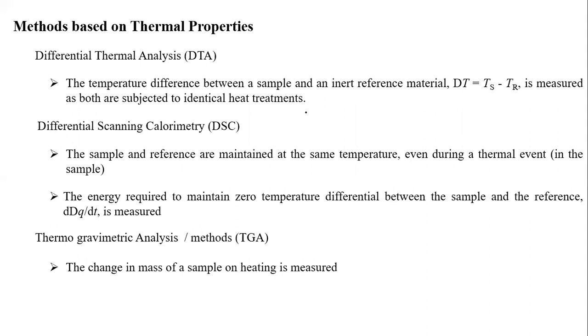What are those conditions? The methods are based on thermal properties. As I said, here we will see some thermal changes. Very first, differential thermal analysis. See, students, it is nothing but comparing with an inert reference. Read this line: the temperature difference between the sample and the inert reference material is measured as both are subjected to identical heat treatment. That means we will take one sample of our interest and go for a reference sample.